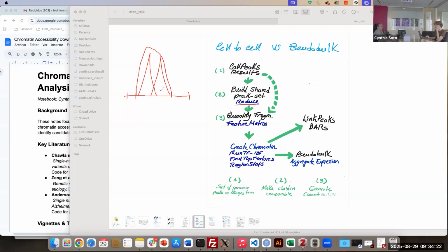It's not the only way to do it, because this function has resources to also, for example, handle one peak here with a small gap here. Let's say this small gap is insignificant for the kind of analysis we are running, or we are not interested in these small gaps. You can tell reduce that we can allow a small gap of a specific number of base pairs. So we can also have a big peak that merges peaks with gaps.